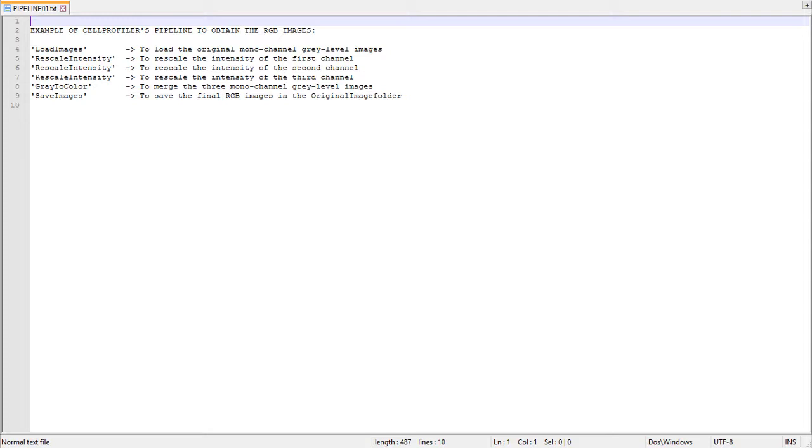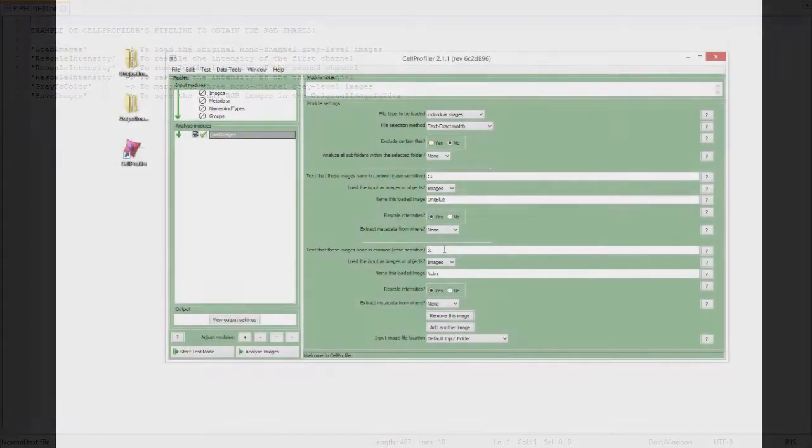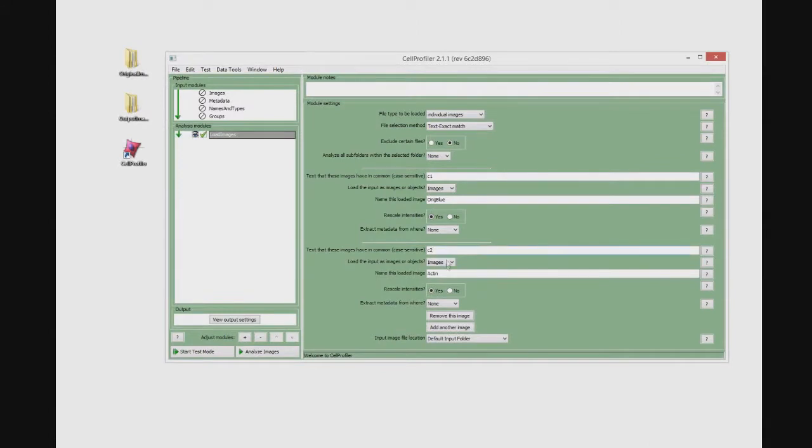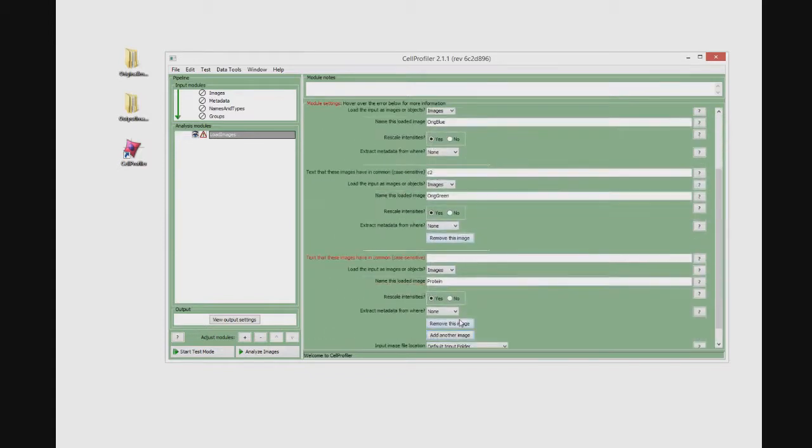Practically, you should simply create a pipeline to load the original images, rescale the intensity, merge the channels, and save the image. Let us do that. We will impose the nuclear staining as blue channel, the cytoplasmatic one as green channel, and a protein expression signal as red.